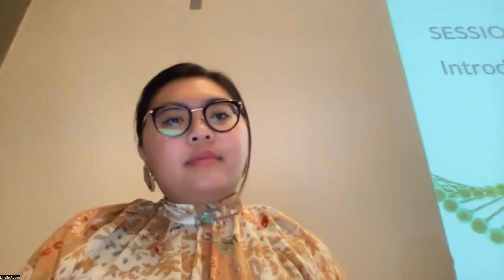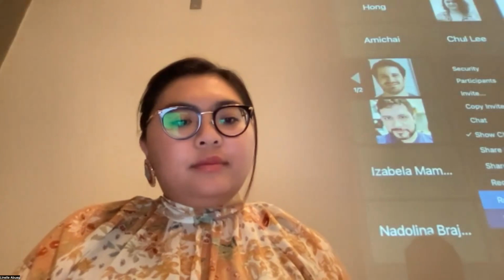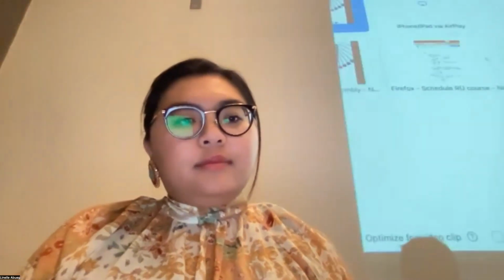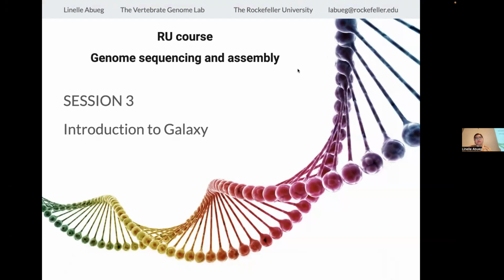So you have this sequence underrepresented in your final data set. And we noticed that in some birds, in chicken or in fish, this happens more frequently than other species. So yes, some biases are more prominent with certain taxa than others because of the underlying characteristics of the genomes.